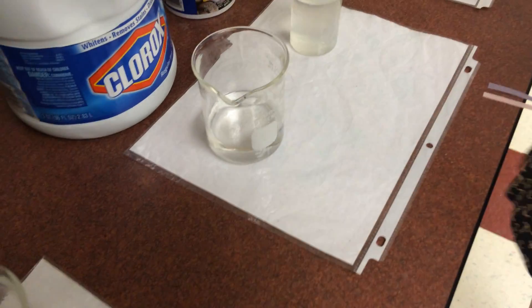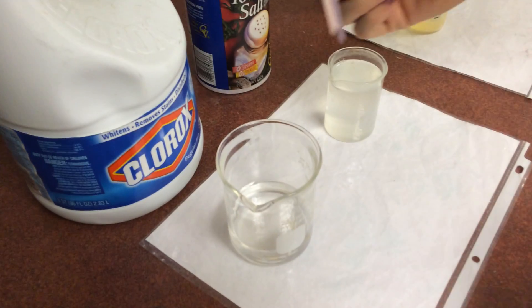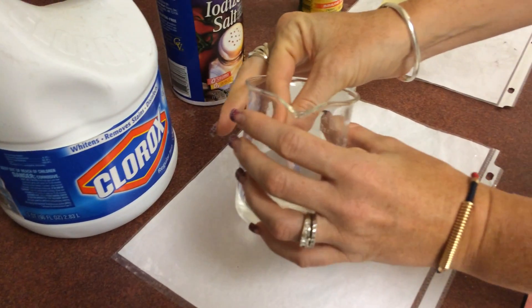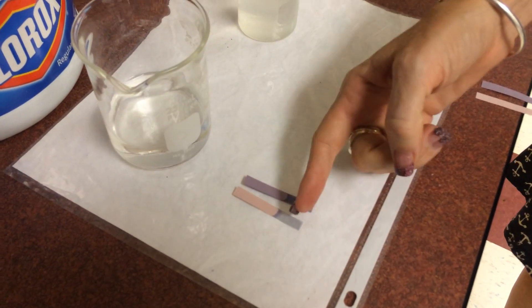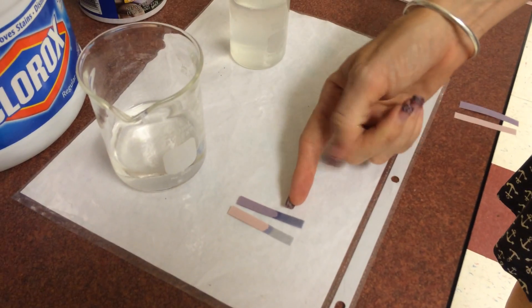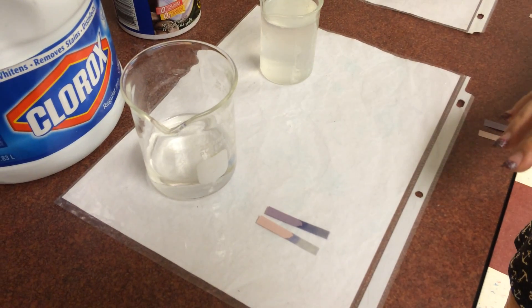Now we have bleach. It's a cleaner, so we can kind of guess what it might be. If I throw our litmus paper in here - holy cannolis, look at that! The red turned blue and the blue got even more blue, which means that bleach is a base.